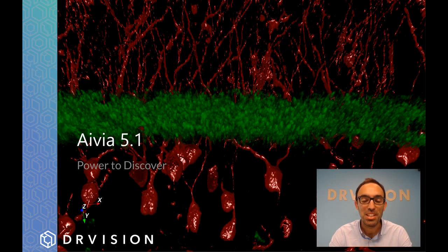I'm the EVP here at DR Vision, and we are here today for the launch of Aivia 5.1. Thank you very much for taking the time to join us today. It will be a brief presentation, probably 35 minutes.